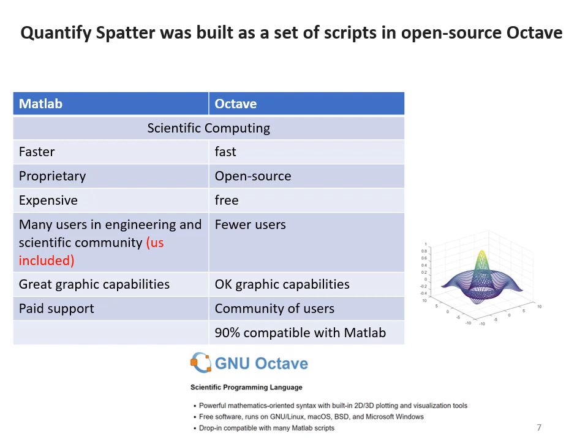So it's free to get. It's not very widely used. MATLAB is used by more people, but like I say, it's very expensive. MATLAB has better graphic capabilities than Octave, so I had to tweak a couple of things to produce the results I'll show you. The support is, you pay for support in MATLAB. With Octave, you can use some of the support material that is available online for MATLAB, or you can ask the community of users.